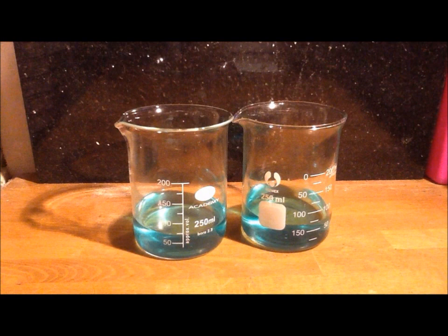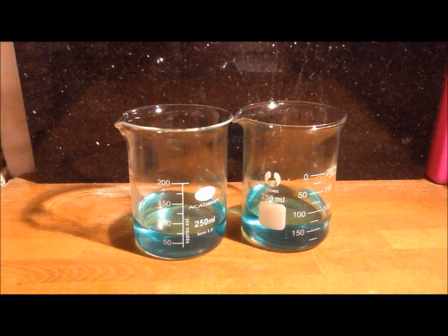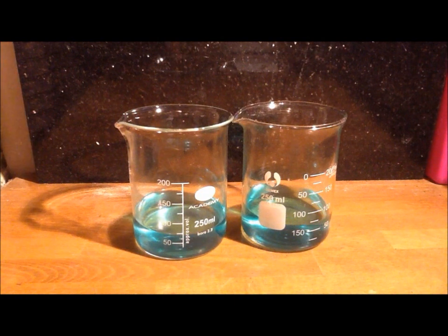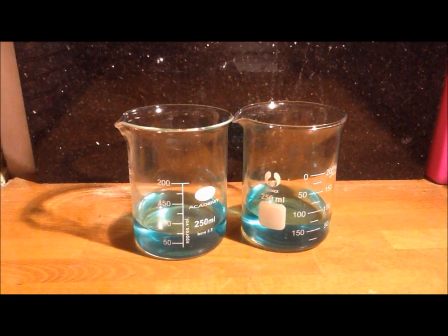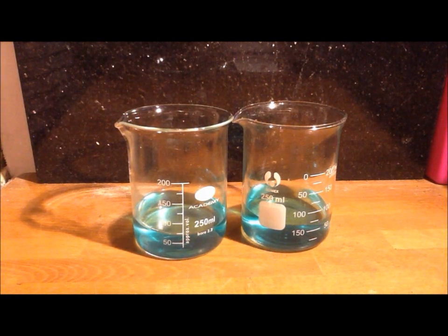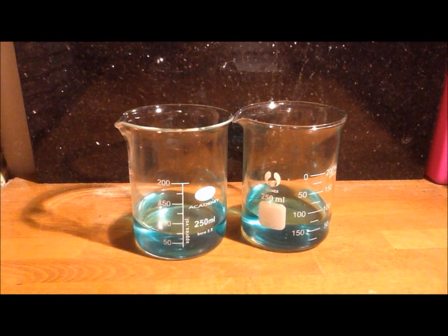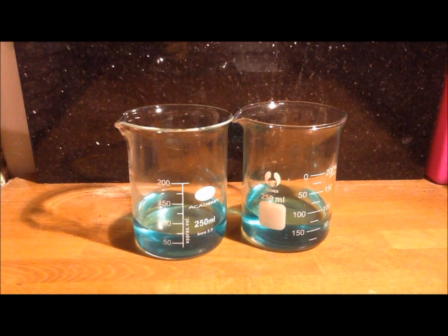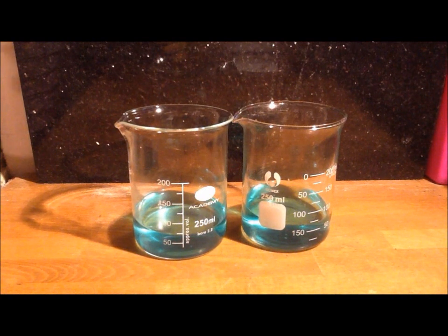Okay, so here we have two beakers full of 75 milliliters of the bleach. And the most common type of bleach is chlorine based, so we'll test for that first by adding hydrochloric acid.